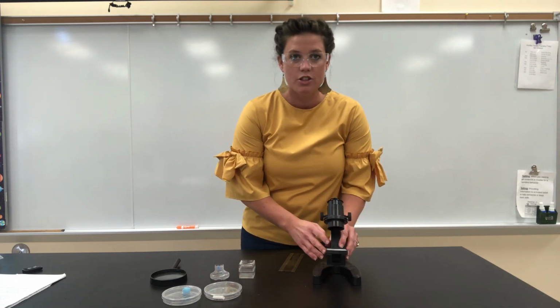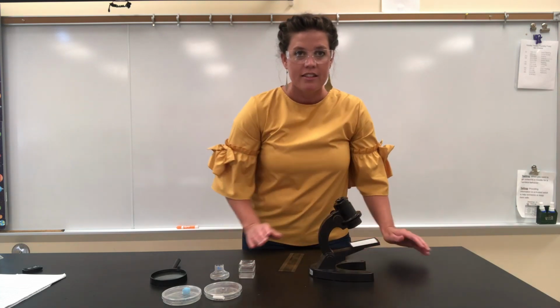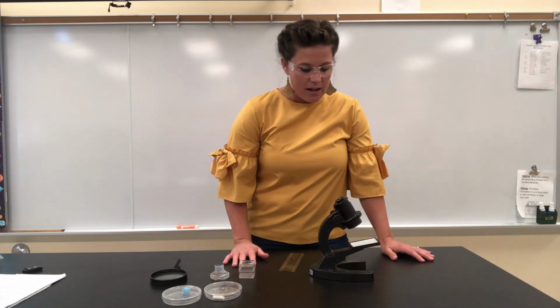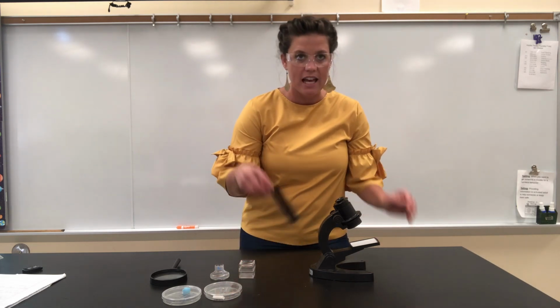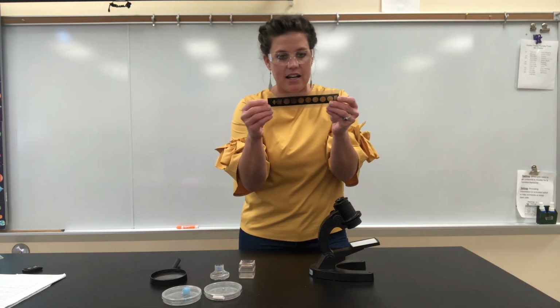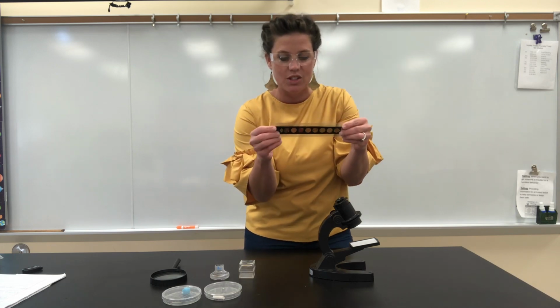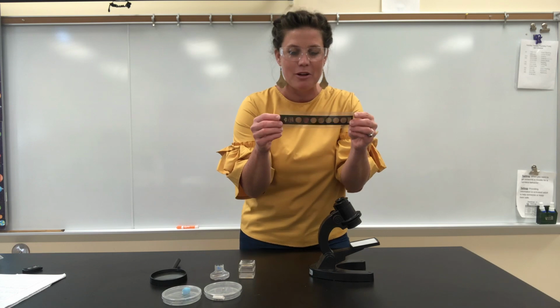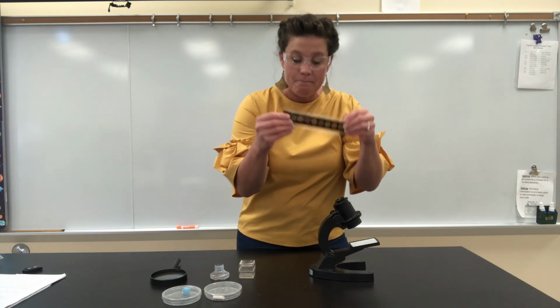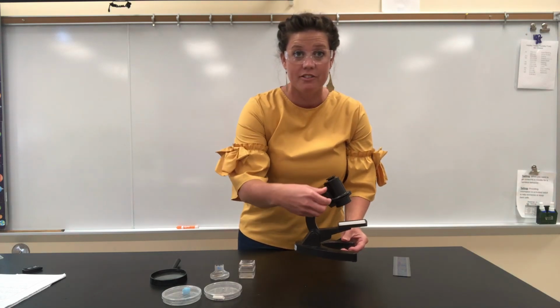The last tool I'm going to show you how to use today is our microscope. This looks a little bit different from the fancy microscopes that you might see in a big science lab. These are the ones we'll use for 5th grade. We have slides that already have cells and cross sections of items in them, such as tongue muscle and cheek muscle from cows, which is pretty cool to look at. When you're using a microscope, you need a slide. You also need a light source, and you're going to be using knobs to focus.